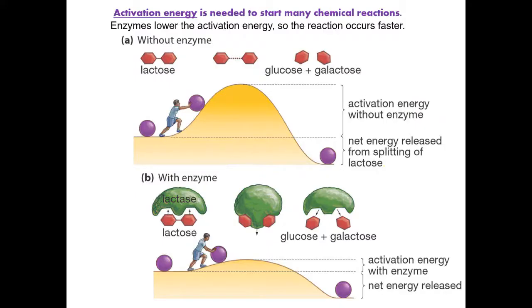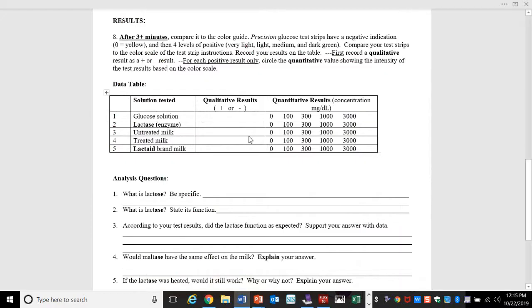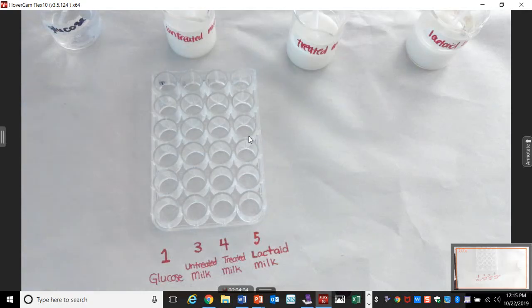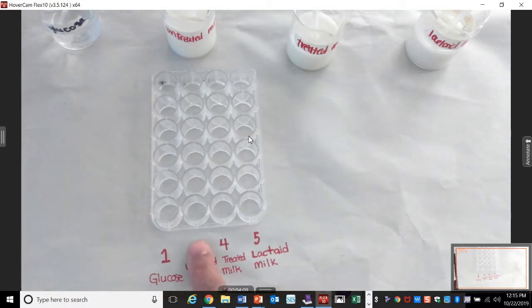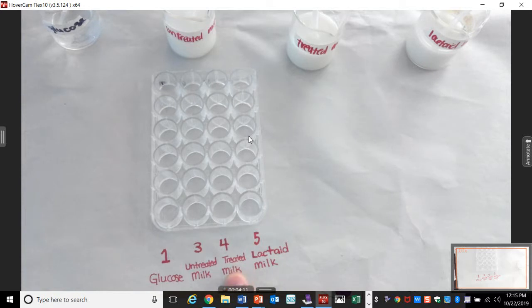When he puts the drops in, the enzyme should break it down. Will that test positive for glucose? Yes, it should. Good. So that's our prediction. So this should be negative. This should be positive.